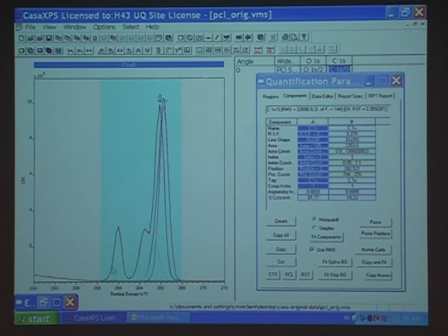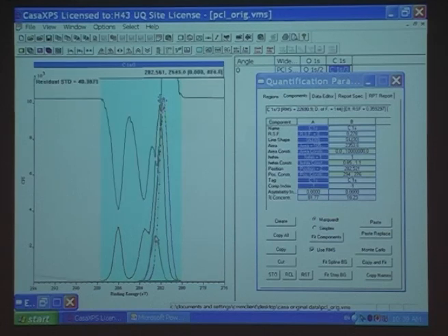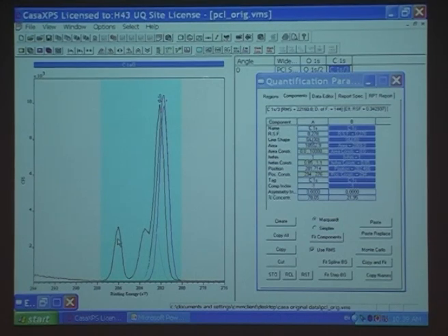Now when I've got a group like this, this is the carboxylic group, carbon with two oxygens. I'll have a carbon next to it that'll be shifted from 285 by about 0.4 or 0.5. In that list in the first lecture, there was a list of carbons, and one of them is the one that's next along closest to that. So I've put it in here, and it has to be the same size as this one. For each one of these, there's going to be one of those.